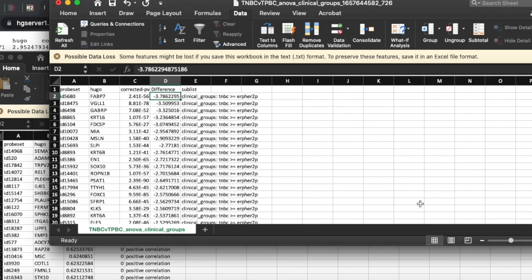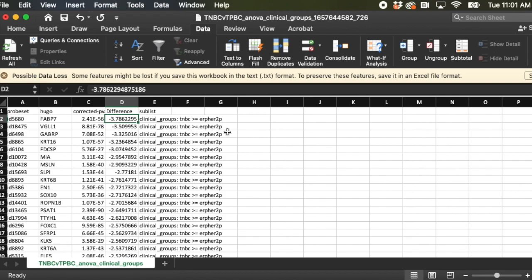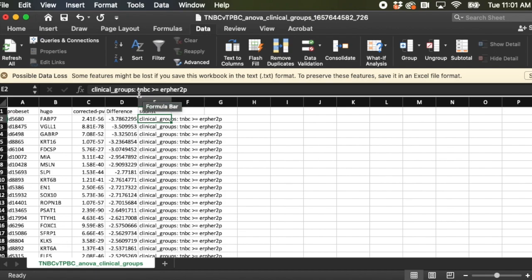Everybody with me? Okay, so now you can look here on the sublist, it's clinical groups and basically what it's saying is that my triple negative breast cancer samples, all of these samples, it's higher than the triple positive samples.